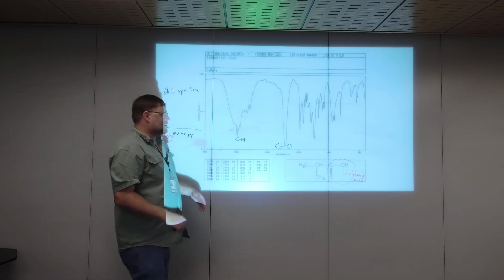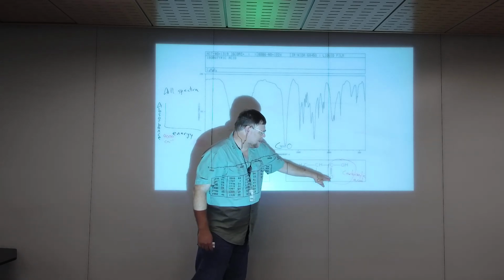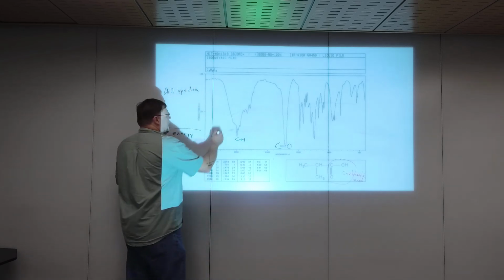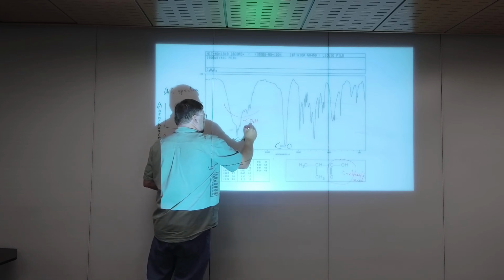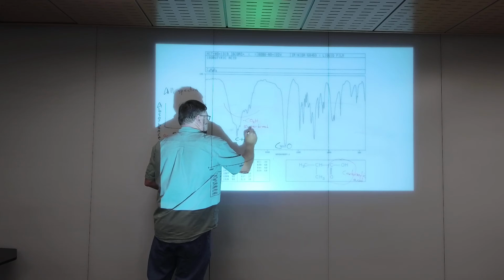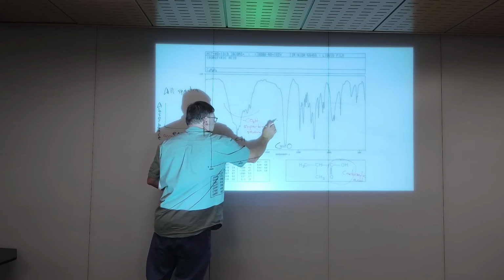And the reason is, if I pull this H off, I get an O minus here, and that O minus can be delocalized over the two oxygens. Anyway, carboxylic acids, which you'll see written as CO2H, have a super broad, strong peak band.